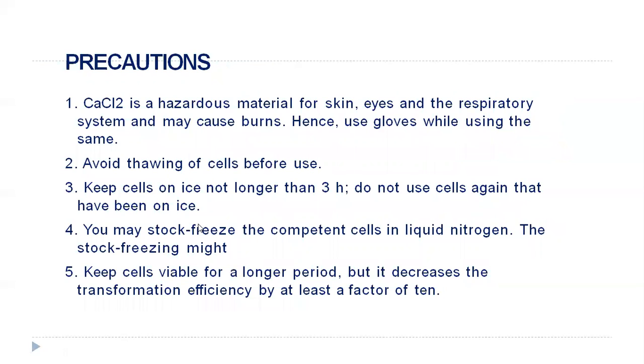So here is the important thing: precautions. What are the precautions? You have to take care because calcium chloride is a hazardous material for skin, eyes, and the respiratory system. So it may cause burns. Hence, use gloves while handling it. Okay. So gloves are very important.